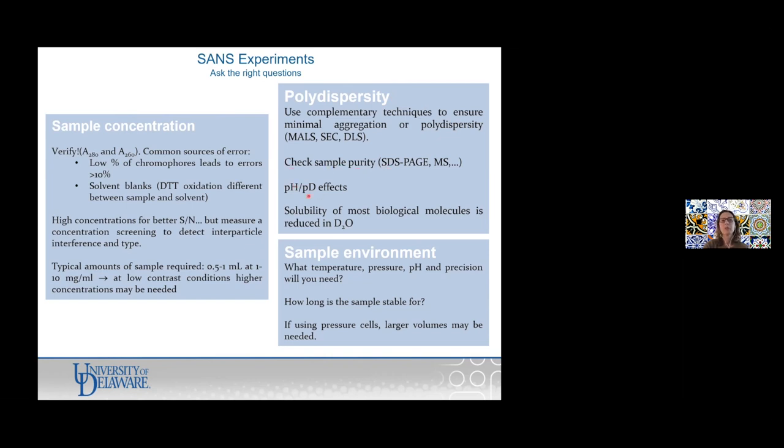Also remember the pH and pD effect. So if you're working with D2O, there could be shifts in your pH that you do not expect. So watch out for those. And also the solubility of most biological molecules is reduced in D2O. So the fact that you're working in D2O buffers can also introduce some polydispersity.